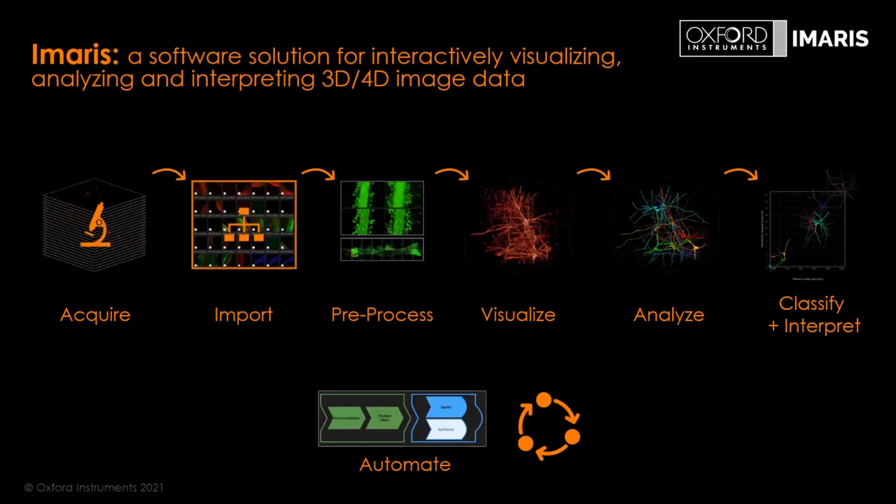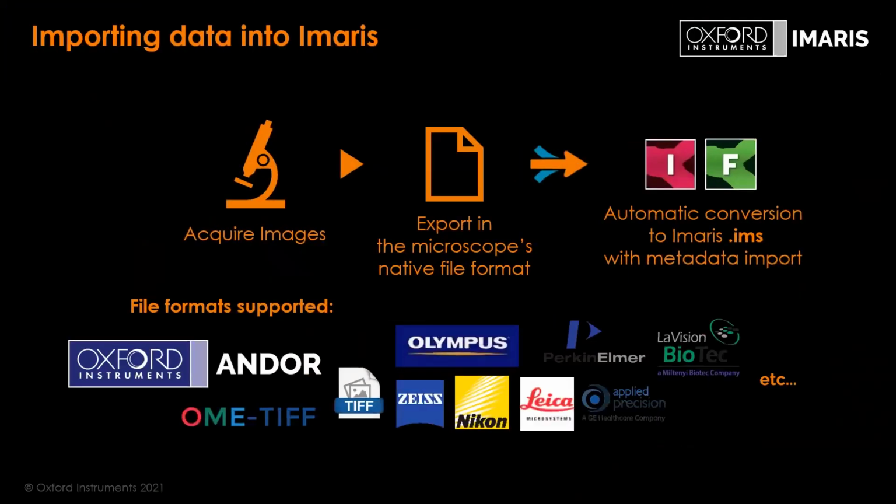So this is the acquisition in terms of modalities. Now in terms of vendors or brands of microscope, you can import a wide variety of data into IMARIS, because we do require a conversion into the IMS file format to have a more seamless experience, to make the algorithms work faster, and to have a seamless zoom in, rotation, and interaction in a 3D environment. So we natively support all the big four vendors like Zeiss, Nikon, Leica, Olympus. You can get your CZI file, for example, and simply convert it with a file converter, or by double-clicking on it in the IMARIS Arena, and it converts to the IMS file format.